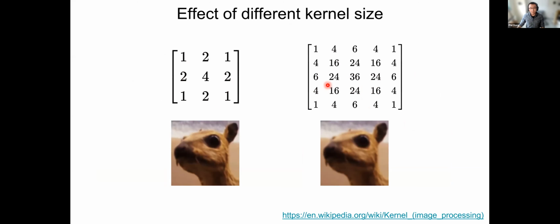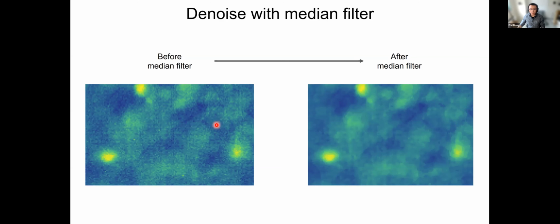And then we use the median filter to do this. The idea is basically that we take the kernel, and instead of doing an average or anything, we take the median value within a kernel, and we use that to filter out the grainy noise. And this type of filter is specifically strong at reducing this salt and pepper type of noise.